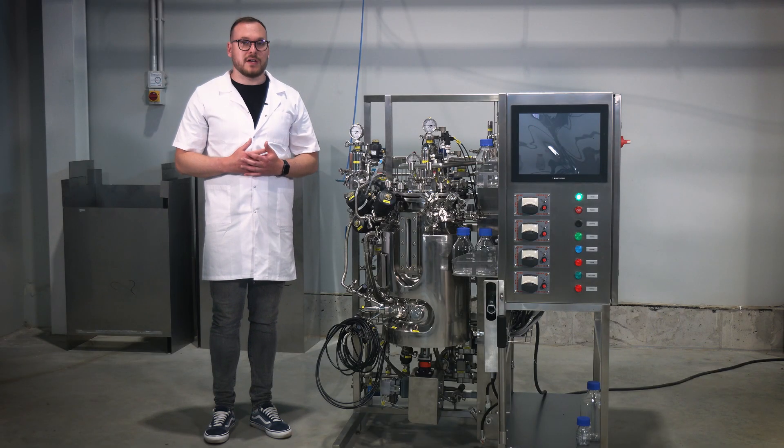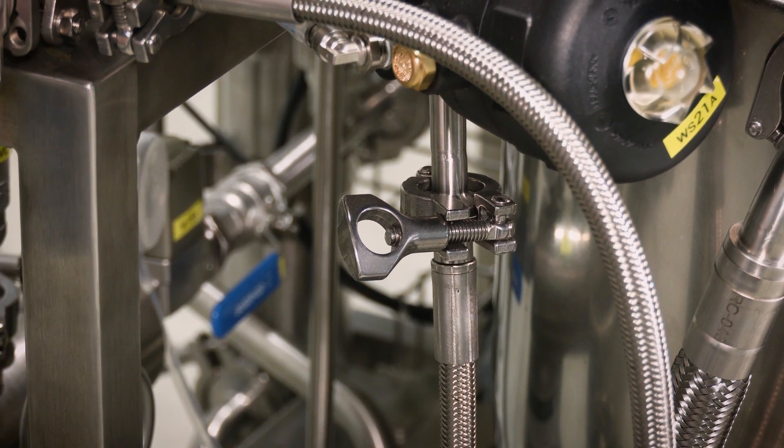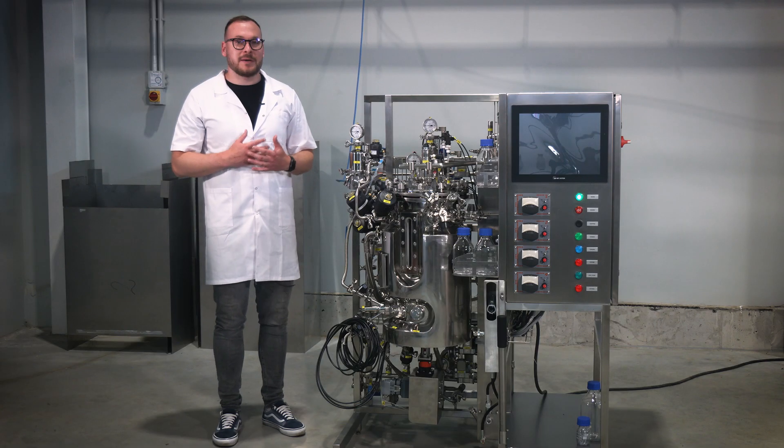Step 11. Using the supplied hoses and tri-clamp connections, connect the condensate discharge from the gas line to the technological skid of the bioreactor. Ensure a tight and reliable connection.